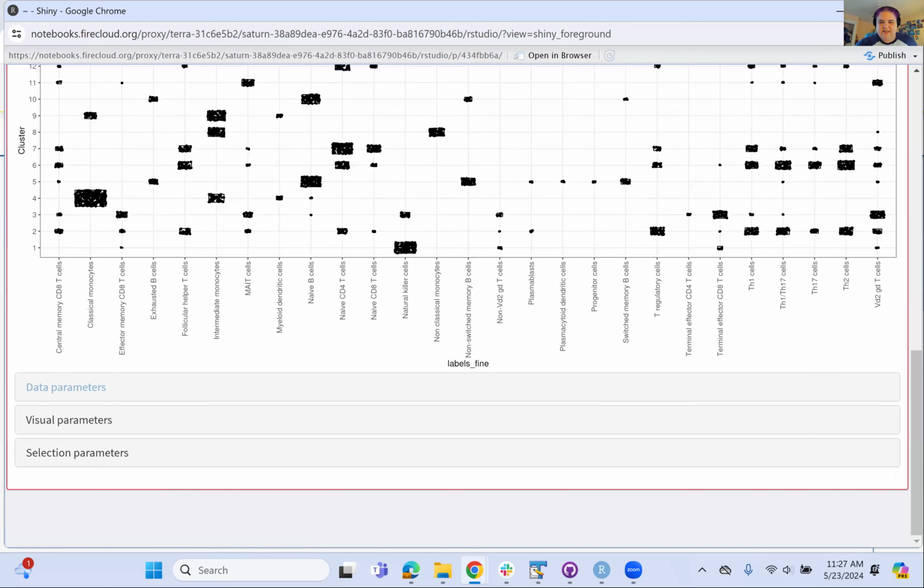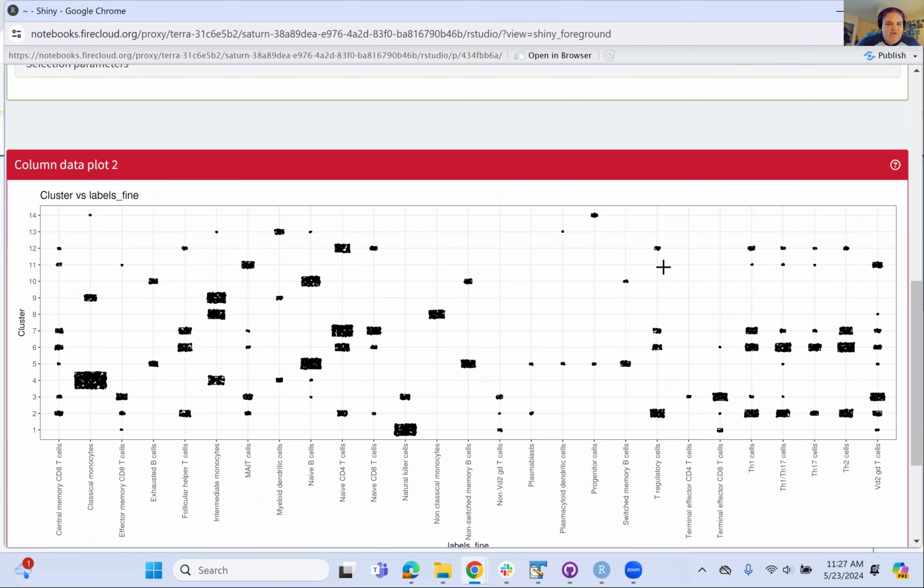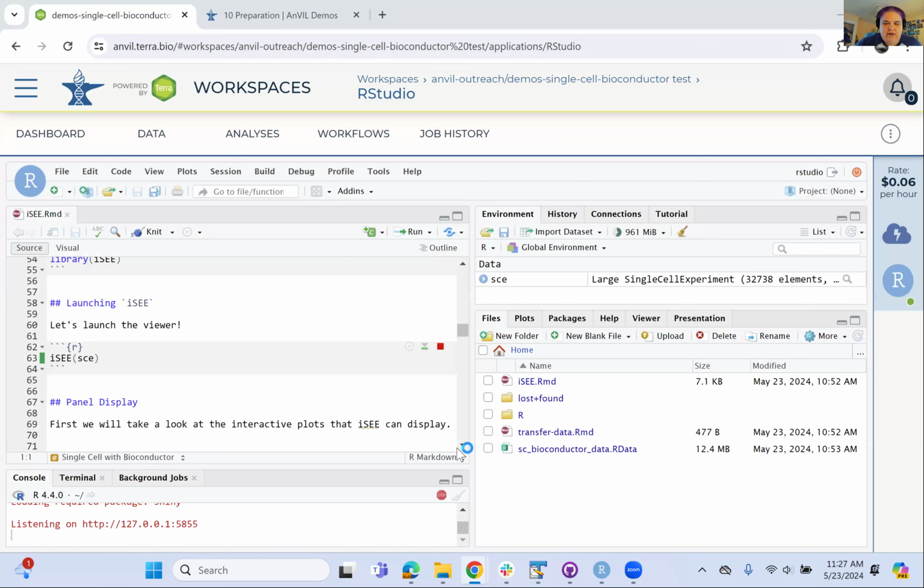All right. Cluster 4. And all right. Oh dear. Okay. So one thing you might run into is that at some point something might happen and your, oh no.